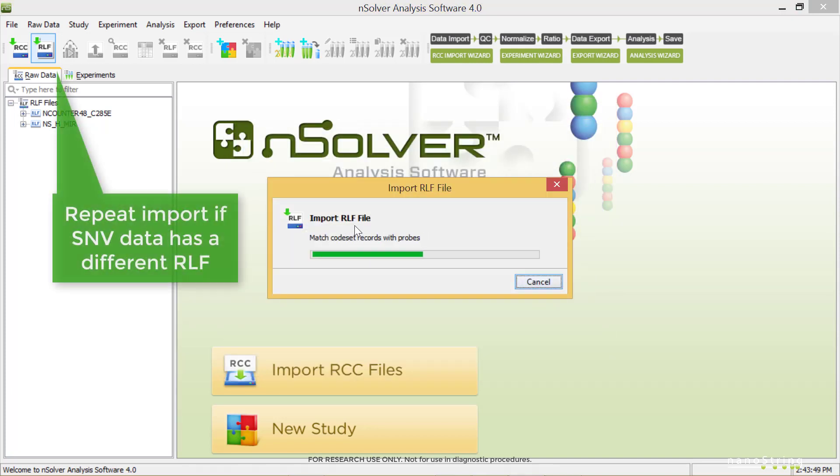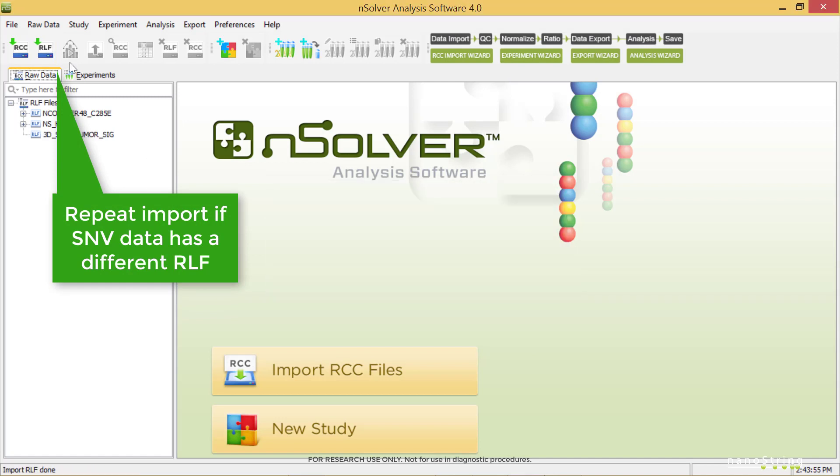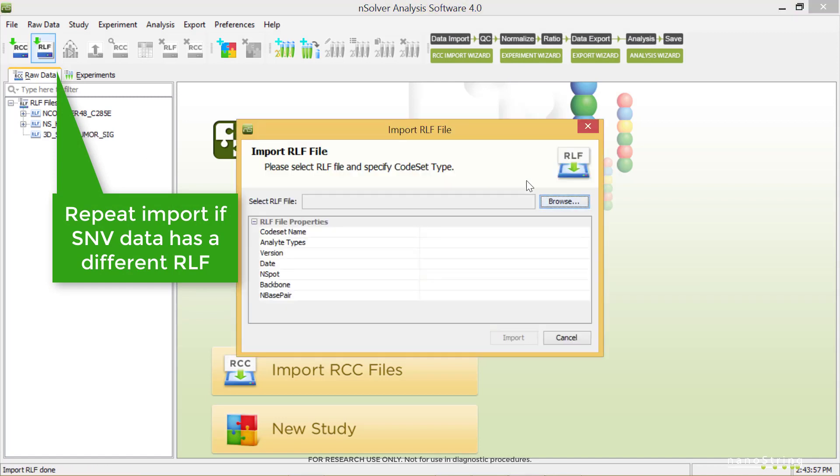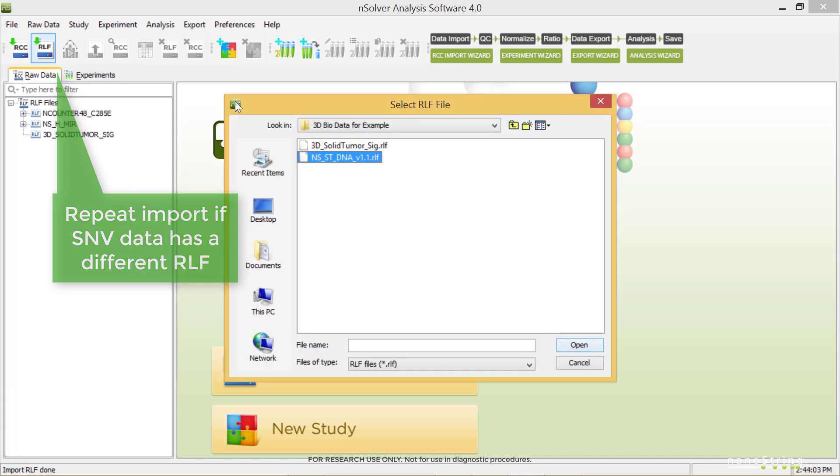If you have any SNV data and your references were run on a different RLF, you'll want to repeat the process to import that RLF now.